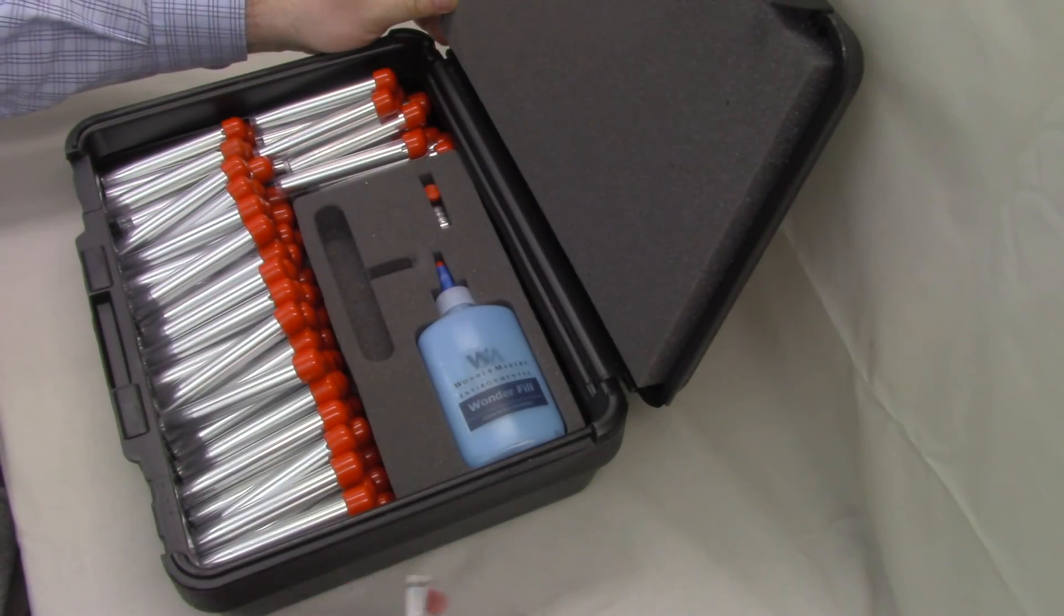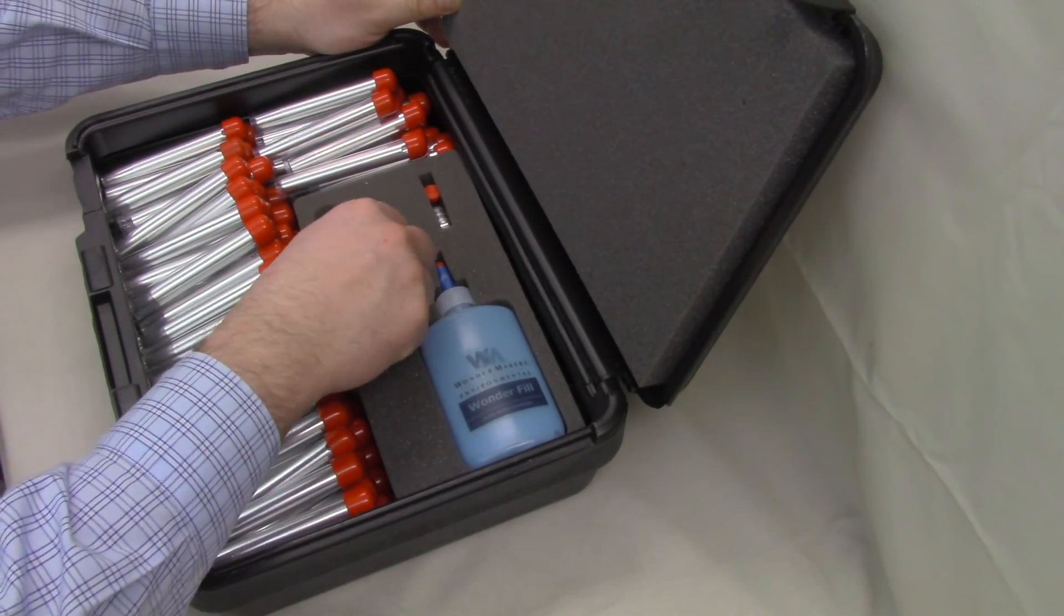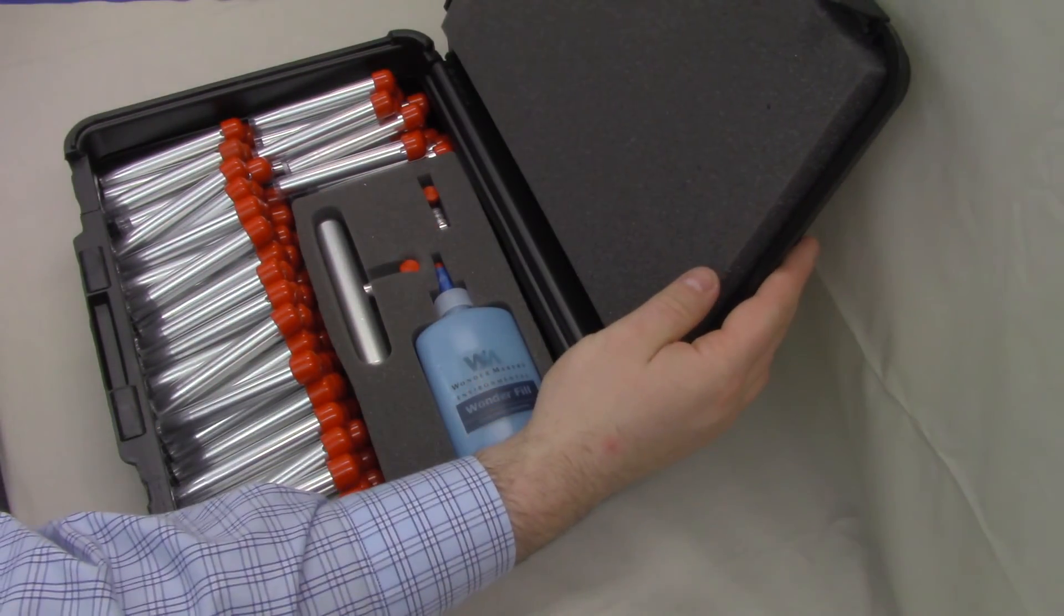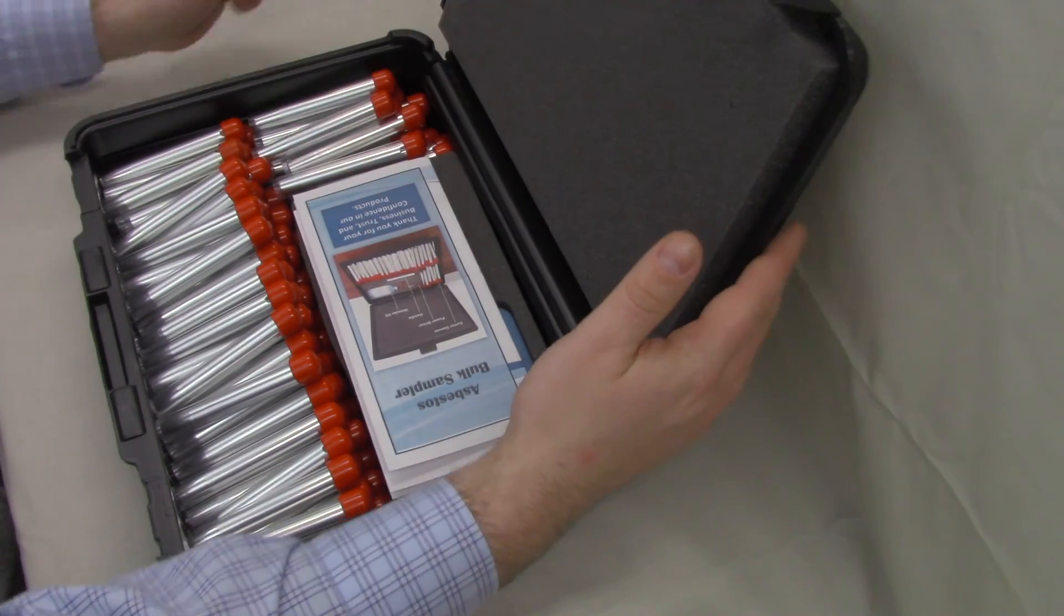I'm going to move this aside then. Bring our case back into focus. I'm going to put this handle back away in the case so it's ready to go to a customer. All right. There you go. One Wondermakers bulk sampling kit.